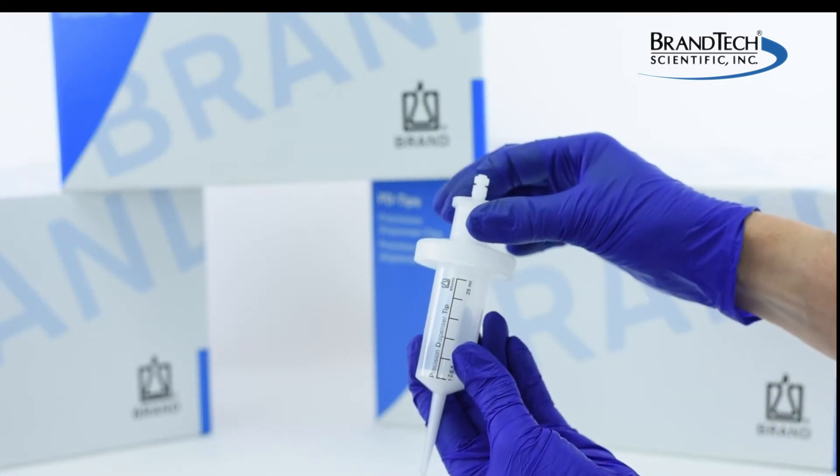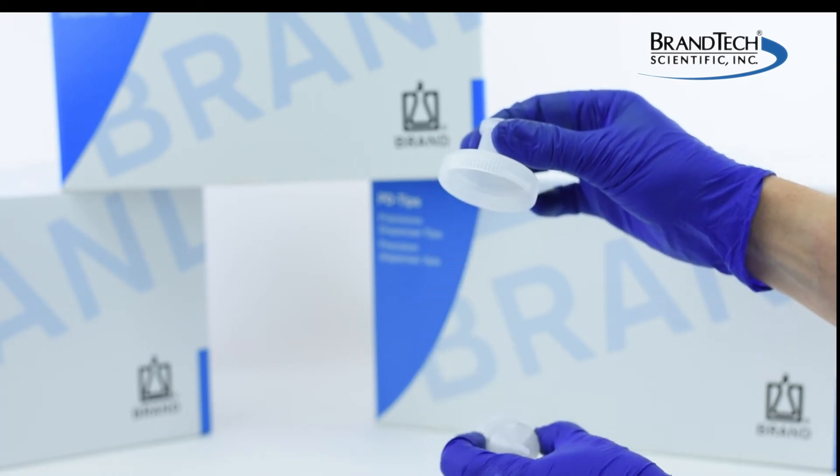Once the tip has been used, the adapter can be removed and applied to a new PD tip.